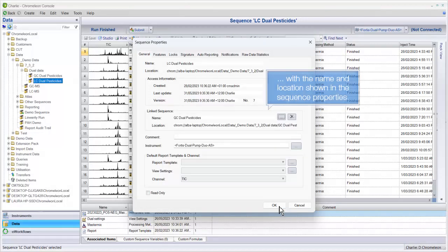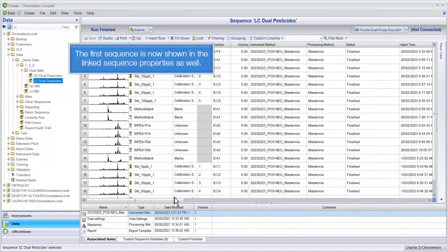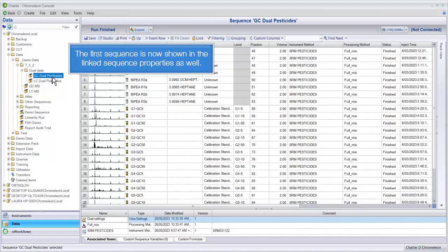With the name and location shown in the sequence properties, the first sequence is now shown in the linked sequence properties as well.